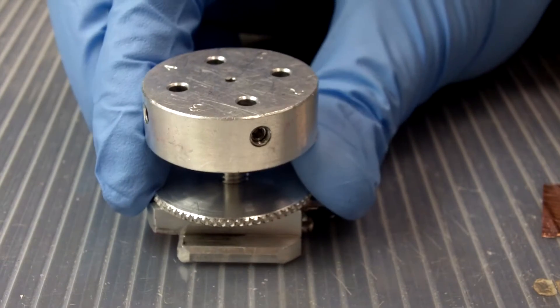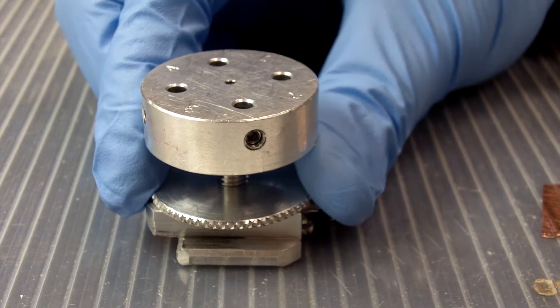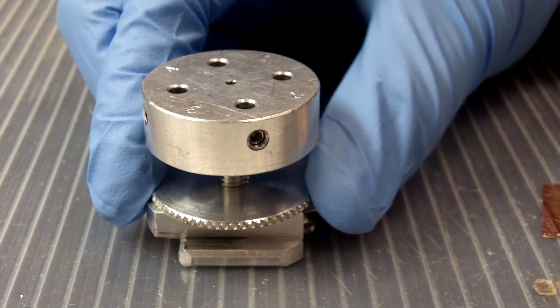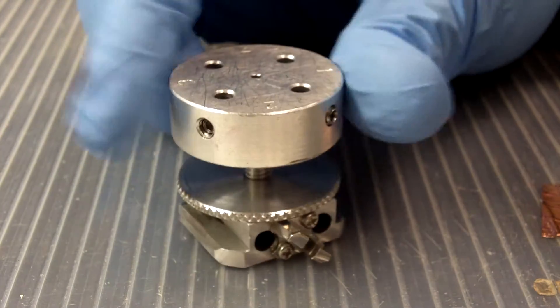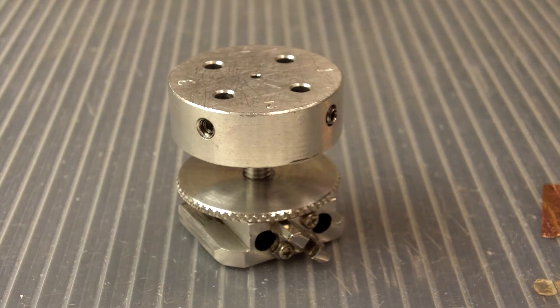I am, of course, talking about the sample holder for the Hitachi Field Emission SEMs. This is not difficult to understand and it is not difficult to use, so let's take a look now at how it's supposed to be used and the many ways it's not supposed to be used.